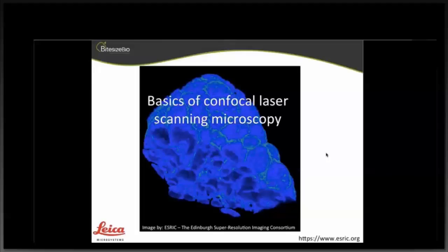Okay. Is there any issues with multicolour imaging, and is bleed-through a problem with this? Yes, it can be. On most, I'm sure on all confocals, there's the option to sequentially scan your image, because often green and red are the two that you use. You can see that the spectrums overlap, so you are going to get bleed-through from the green into the red if you image both at the same time, but it is possible to sequentially scan one and then the other, which will minimize this. There are also tools to spectrally unmix, and this is possible. Again, it needs to be done very carefully to make sure that you're doing it correctly, but it is possible for things which are quite close together, such as GFP and YFP.